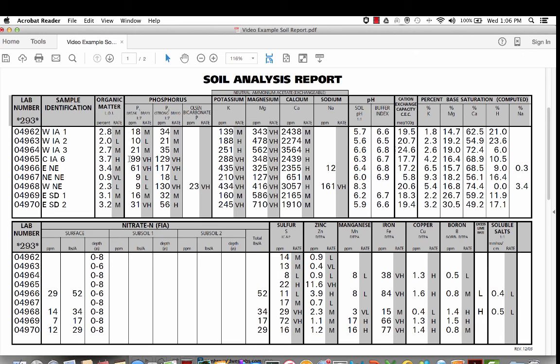When we see numbers that high, sometimes we question why the number would be that high. When you've got phosphorus numbers near 100 parts per million, generally that's going to indicate maybe some manure has been applied in the past. And in this case, I would say that's probably the issue. Now, we don't see the potassium number being all that high, and a lot of times manure is going to affect phosphorus, potassium, and oftentimes zinc as well. As I look at phosphorus, certainly that would indicate maybe some high fertility that might come from repeated manure applications. The potassium really doesn't make me think that manure is necessarily the issue.